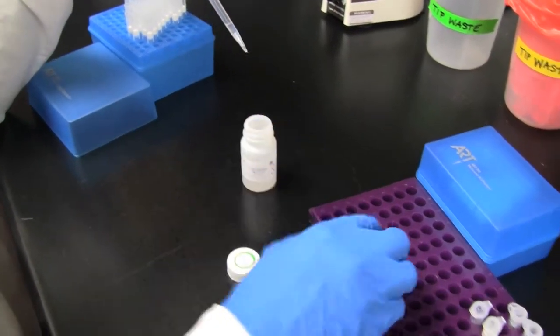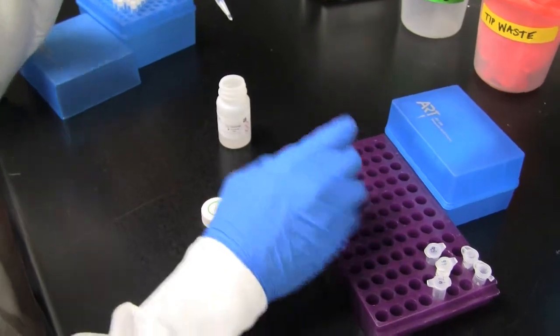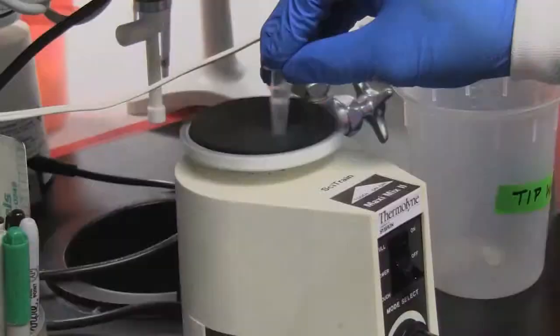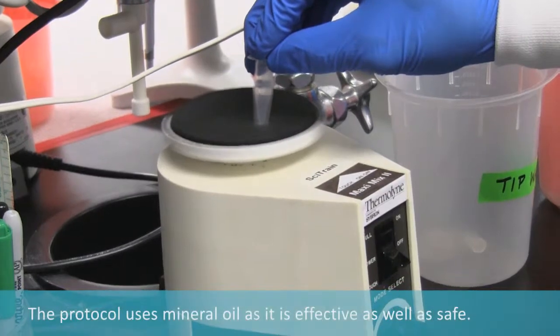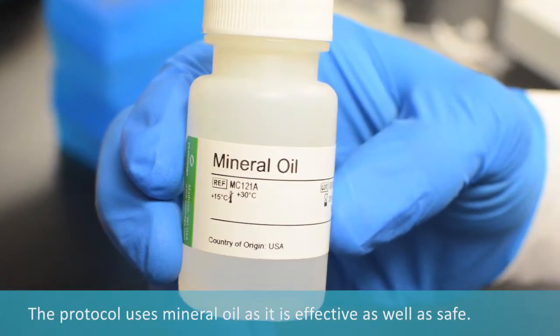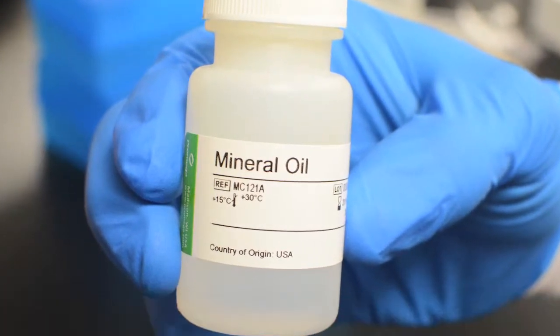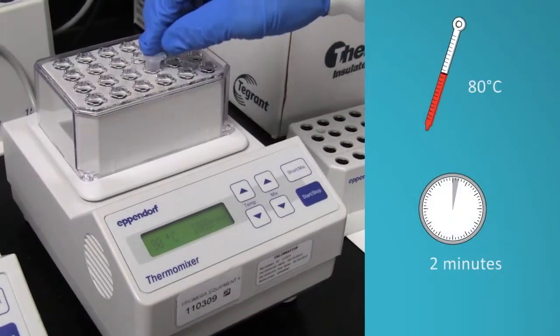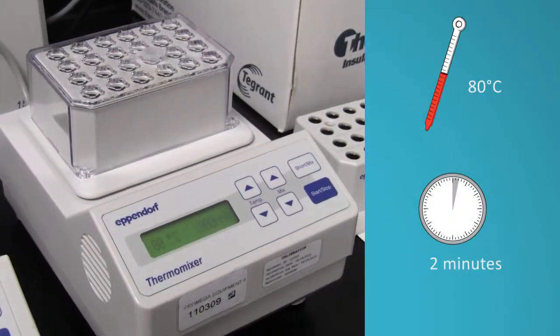Add 300 microliters of mineral oil and vortex for 10 seconds to dissolve the paraffin. Other protocols might use xylene or citrus salt, but we use mineral oil as it is just as effective and less toxic. Heat the sample for 2 minutes at 80 degrees Celsius to help dissolve the paraffin.